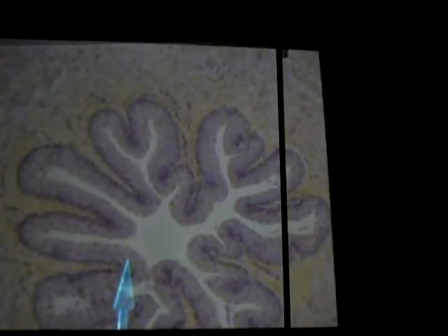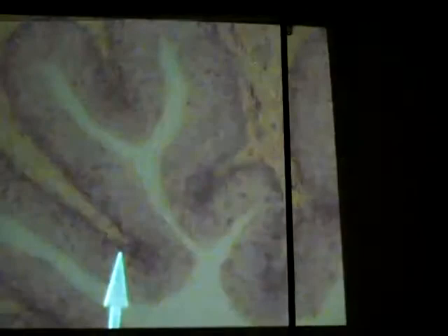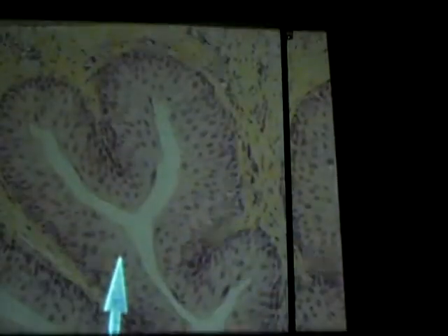To what we saw at the beginning of, or right at the renal pelvis there, we saw that transitional epithelium. Alright, so that's going to lead straight into the ureter. So once you see transitional epithelia, you know it's either the ureter or your bladder.